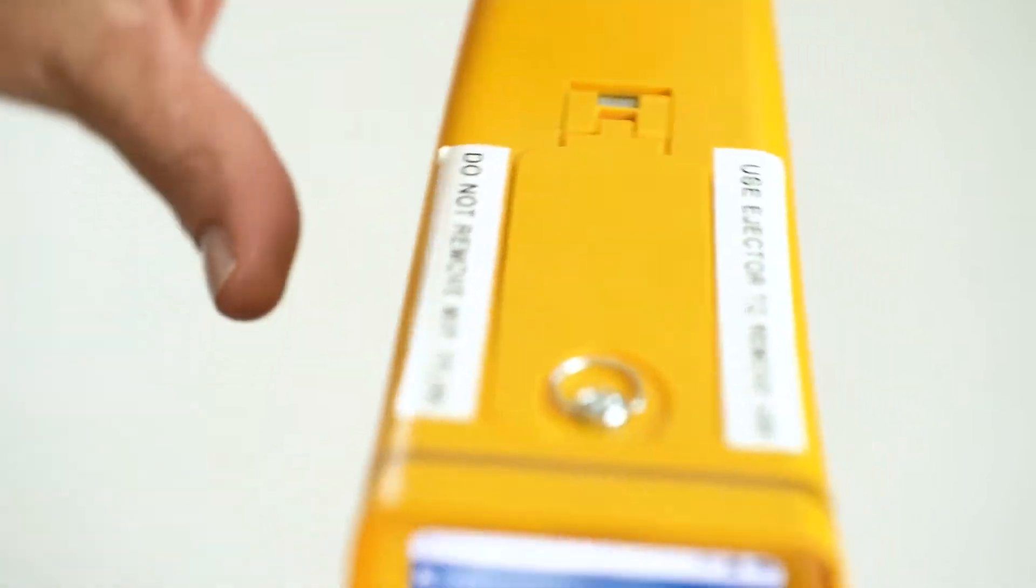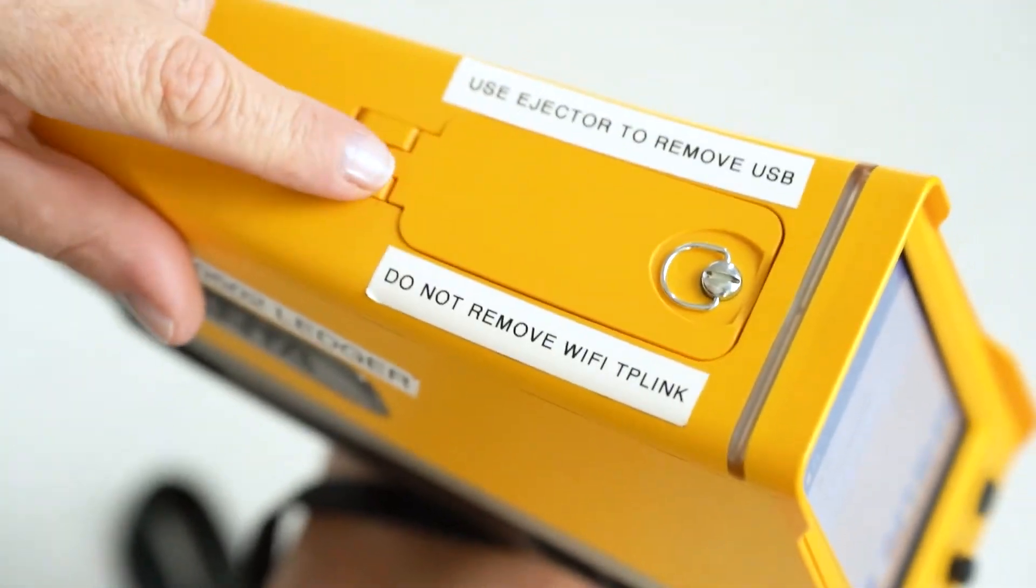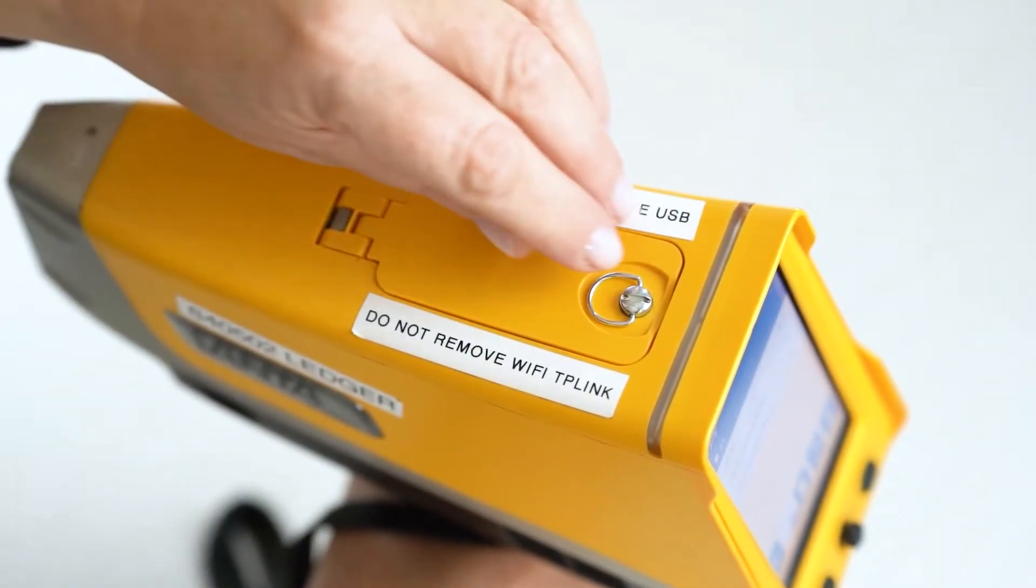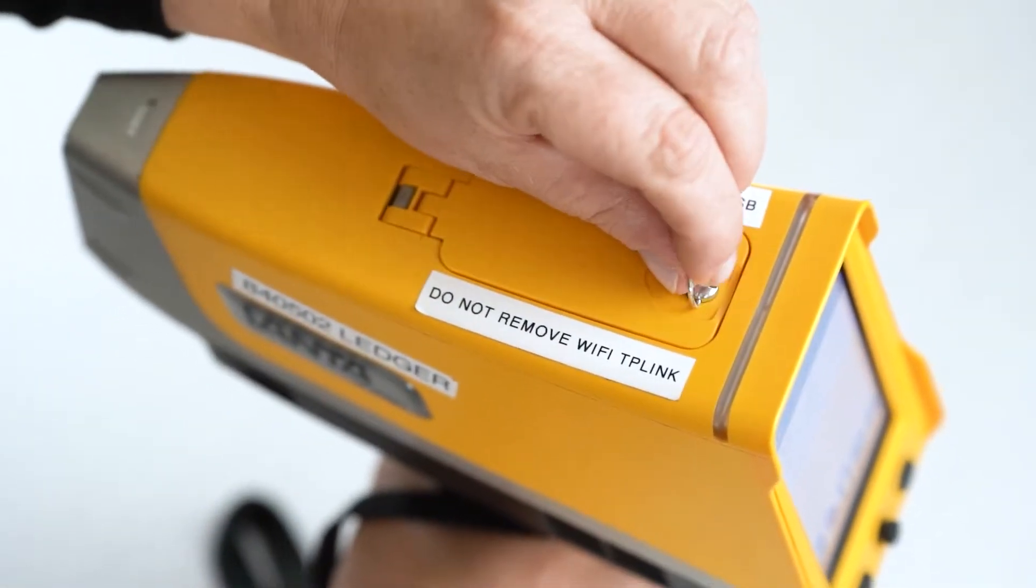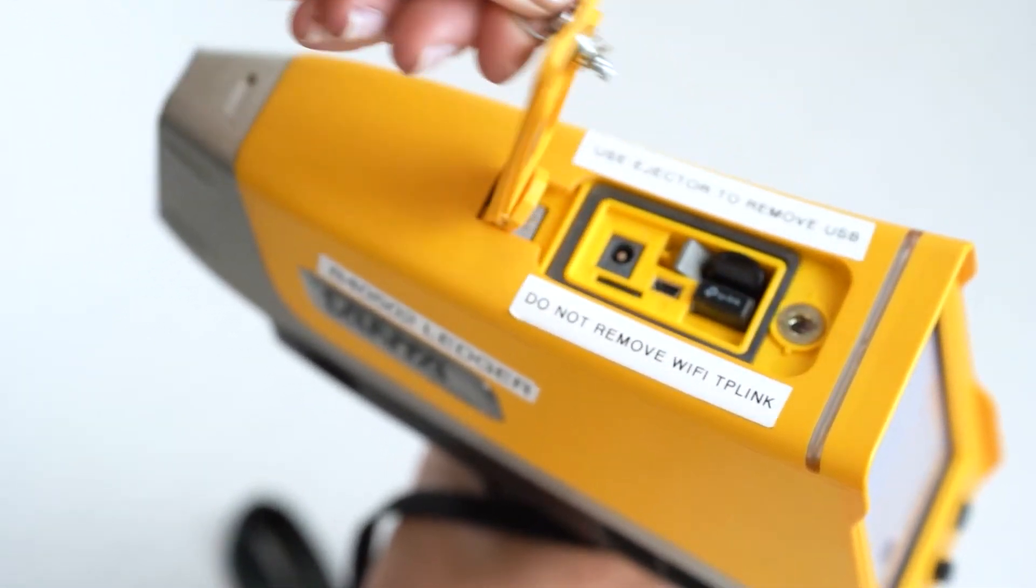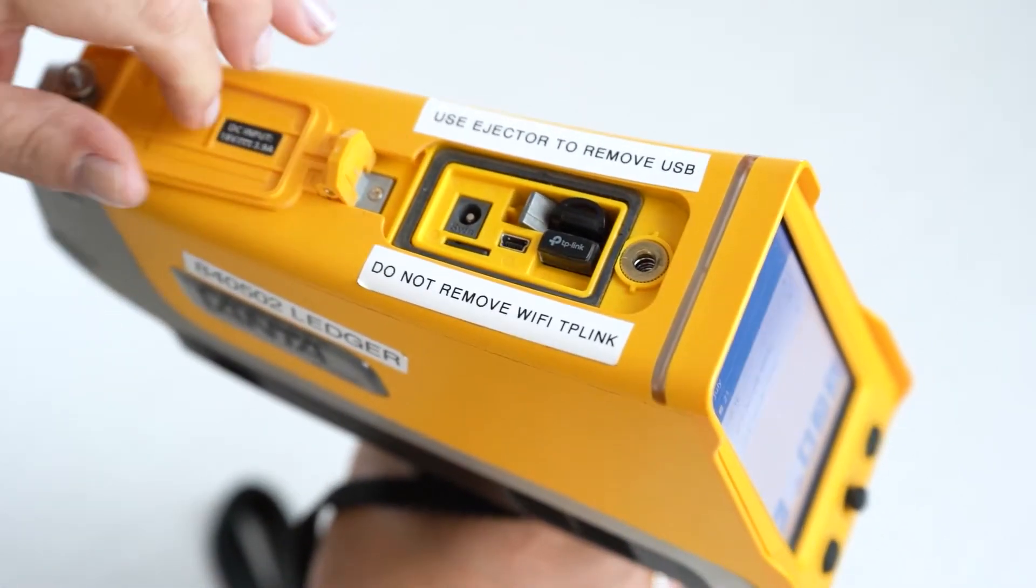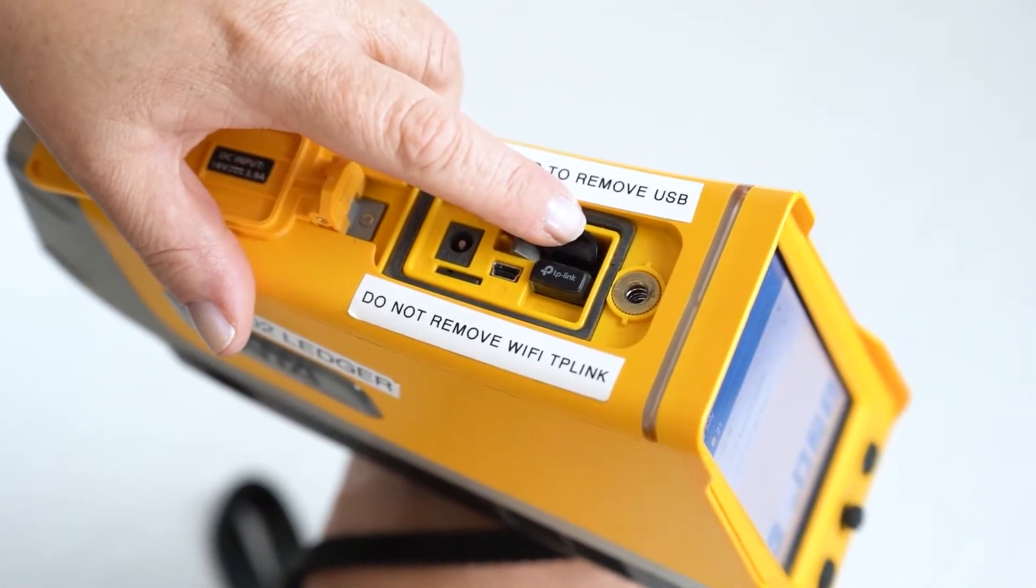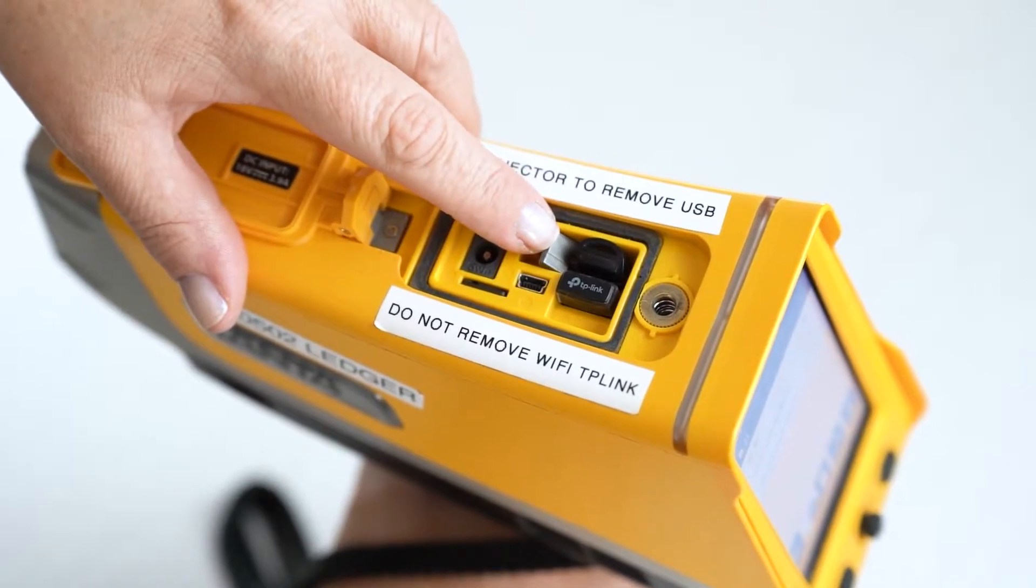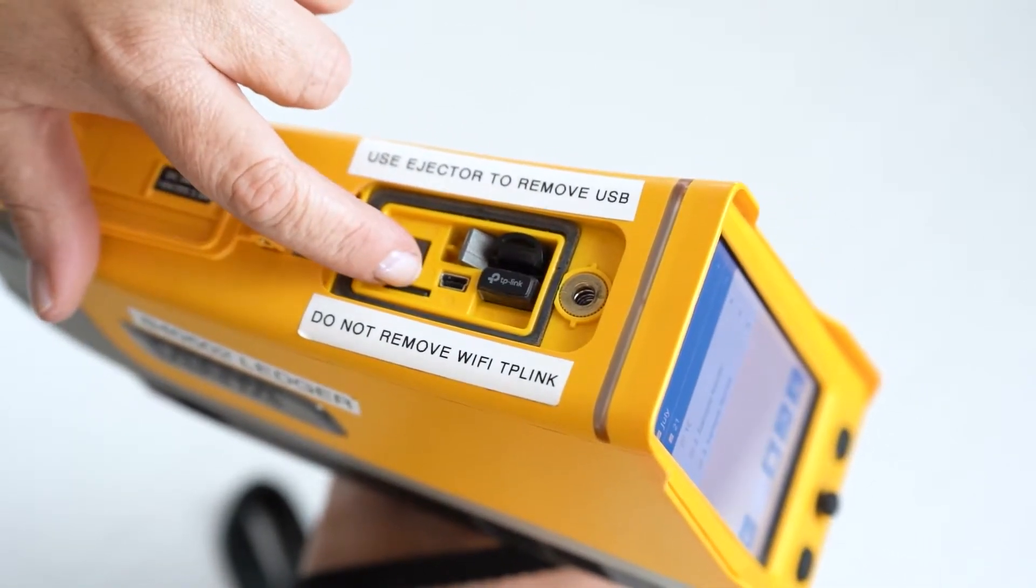You're going to go to the top of the instrument here and locate the data port cover. Grab the metal ring, turn it anti-clockwise, lift and open, and there you'll see the USB and the ejector button. There's also the SD card there.